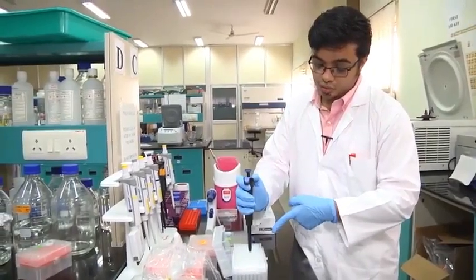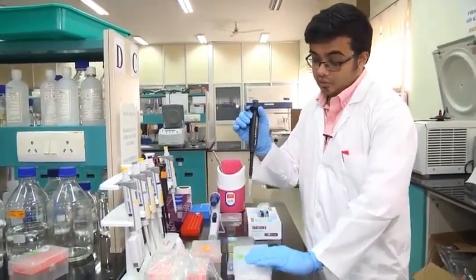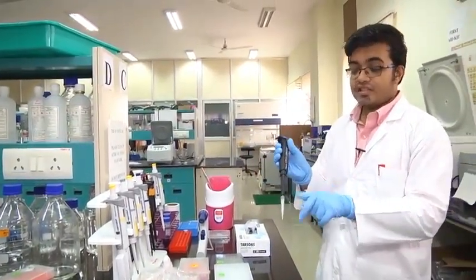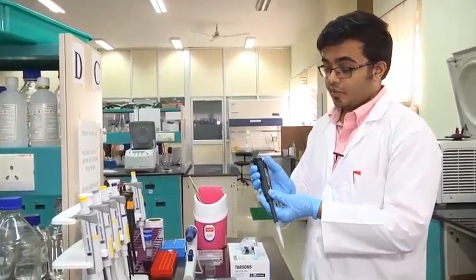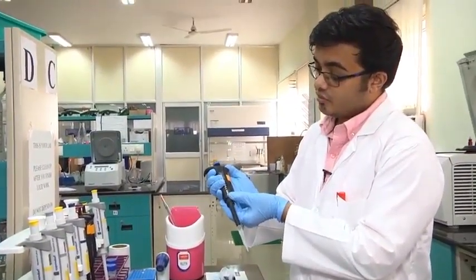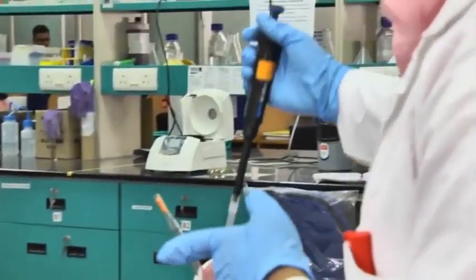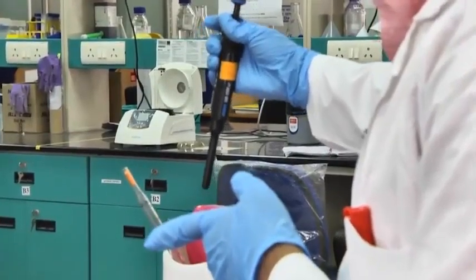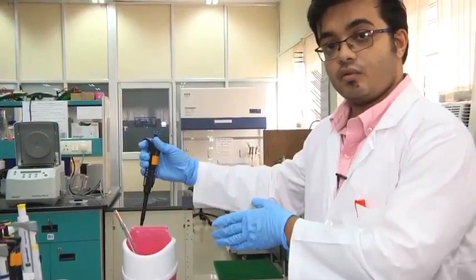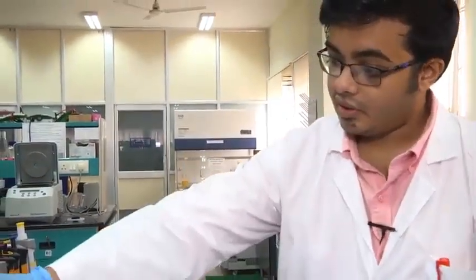So I just showed you how to affix a pipette tip to the pipette. After using it, we need to detach this, which we call ejecting the pipette tip away from the pipette. It can be done very easily. You will notice that this region slides when I apply pressure. And as I apply pressure, this moves down. When I apply sufficient pressure, the pipette tip falls off. That is how we eject tips from pipettes.